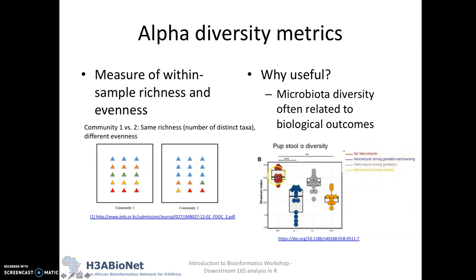You can see that that clearly has a dramatic effect on the alpha diversity. Each one of these points represents one sample, and for each of these samples, we get a specific numerical index of alpha diversity.